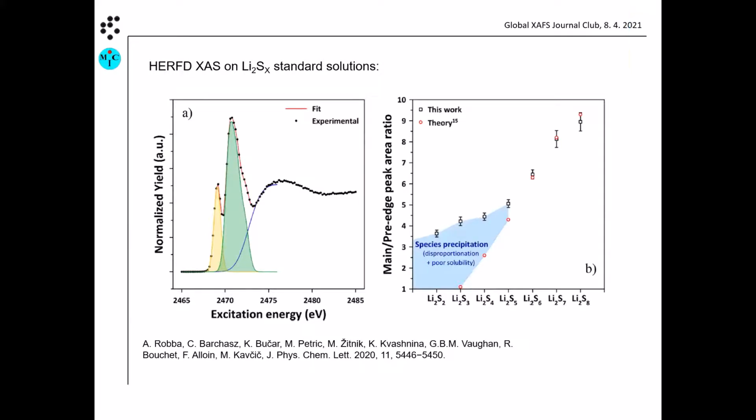Because the doubt is, of course, that in energy dispersive mode, not all energies are reflected with the same weight. So there is some instrumental function which is unknown, or you have to guess it. So comparing against a scanning spectrum would, of course, be more direct. So you didn't do it?